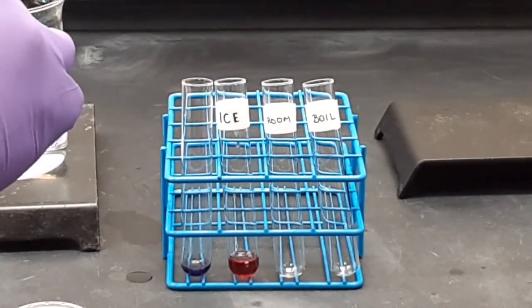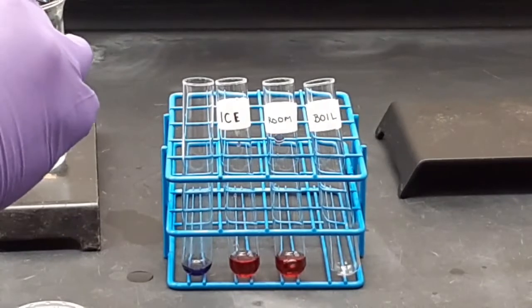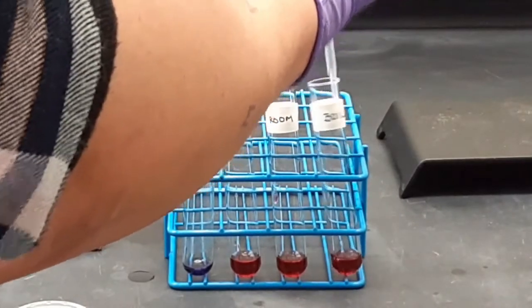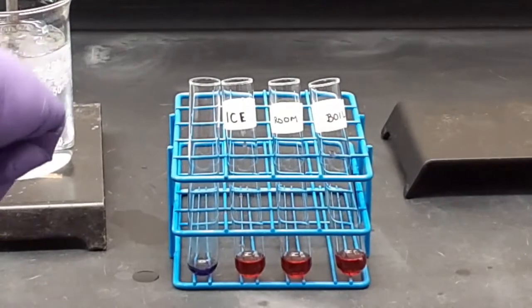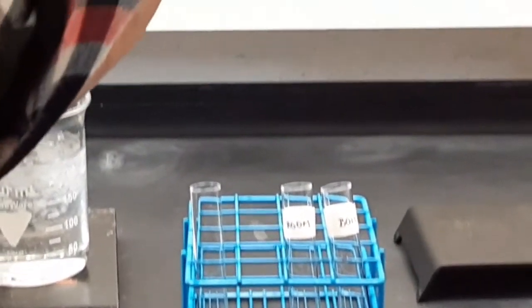Now we'll set up cobalt chloride for the temperature series. The exact amount isn't really important this time. We have our little ice water bath.